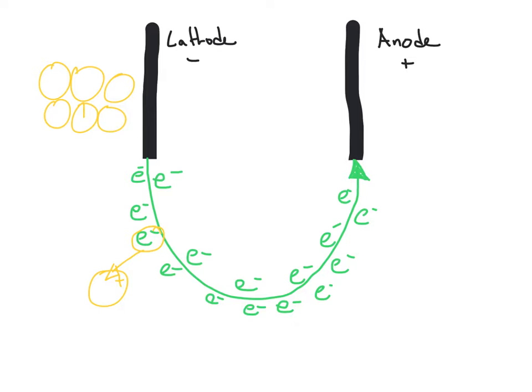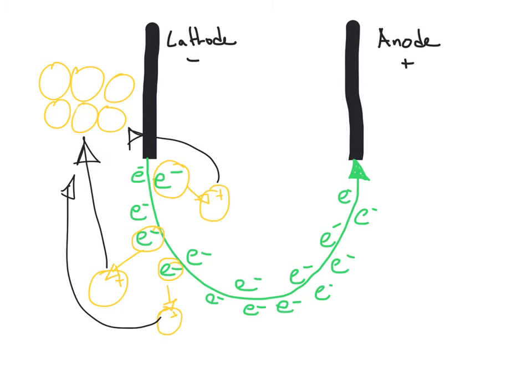When it was neutral, the water was no longer attracted to it, pulling it apart, which is why we were able to see it come together and form the solid copper at that end of the cathode. Once that happened enough times, that's where we got to see the solid copper that was growing in amount, especially on day 2 after the reaction had occurred overnight.